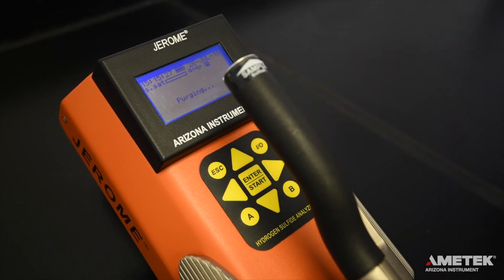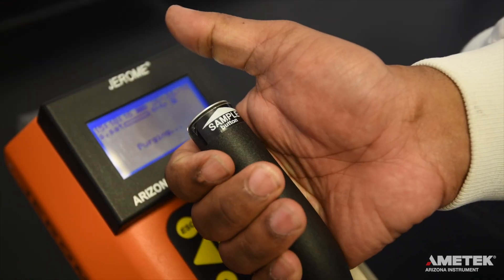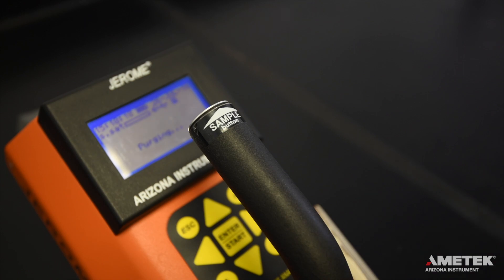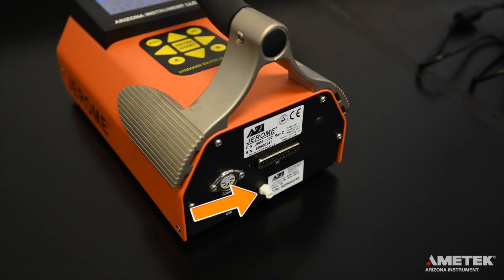To take a sample, you can either press the enter button on the keypad or the silver sample button at the tip of the handle. At the end of the sampling cycle, the reading will appear on the screen in ppm or ppb. It is important that you do not obstruct the intake or exhaust ports. Do not allow the probe or the intake to draw in liquids. At the end of a sampling day or if the sensor becomes saturated, perform a sensor regeneration cycle.